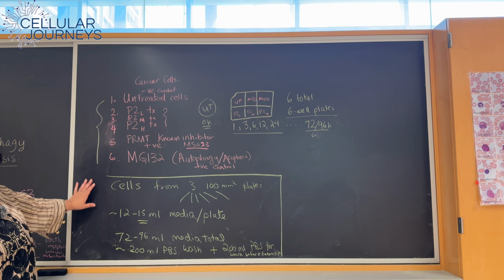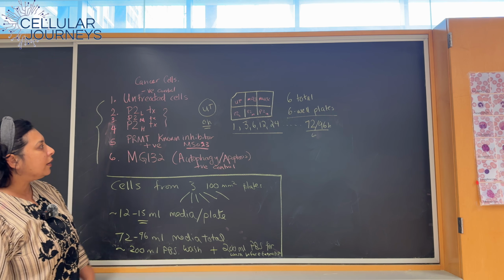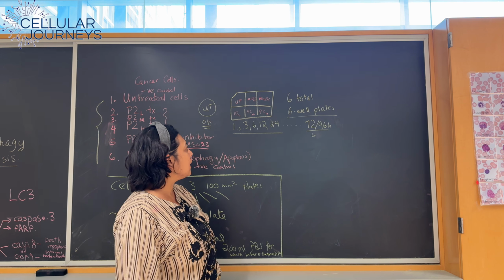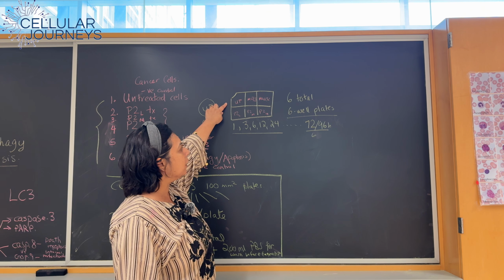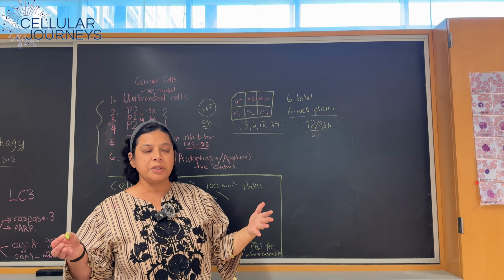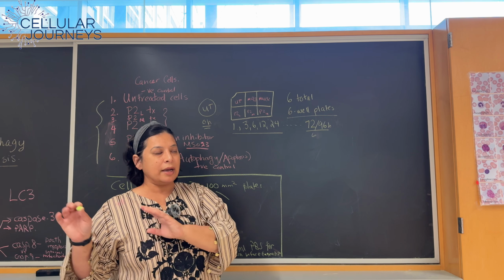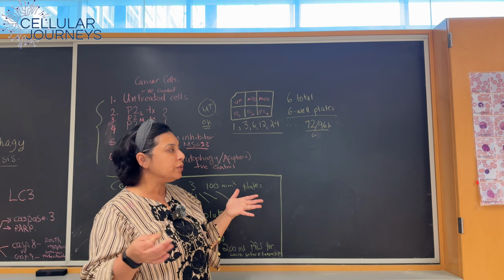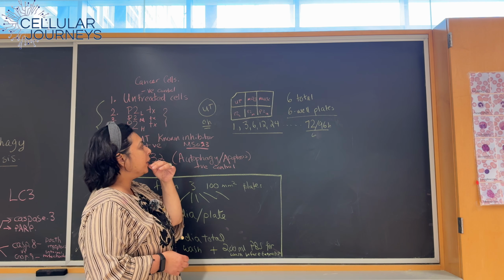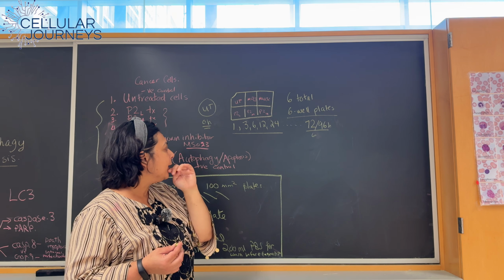And so those are just the basic things that you will need for your experiment to work. Similarly, you also want to think about how many tubes you're going to need to collect your samples. For each sample, at each time point, you're going to have a single tube. You could divide that up into 2 tubes if you want to conserve one and keep it in the freezer for future or backup, and then have one set that you are using. I typically extract from a small well with anywhere from 50 to 100 microliter of extraction buffer.